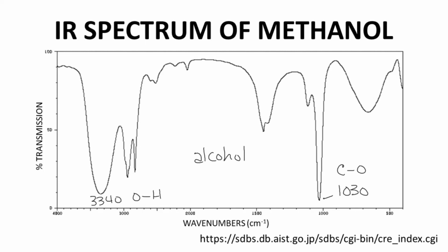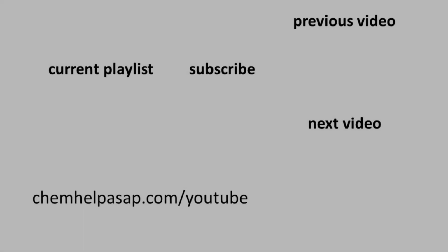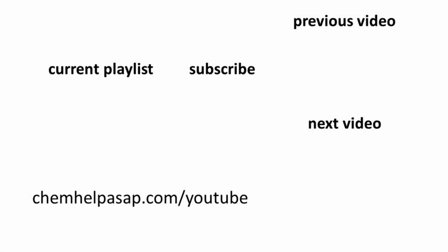IR spectroscopy is very good at identifying many functional groups, but it is less useful at identifying a specific molecule. For example, the IR spectrum for other alcohols like ethanol, propanol, or butanol would look much like this spectrum. So IR is best for identifying functional groups. That is a very quick introduction to IR spectroscopy and reading an IR spectrum.